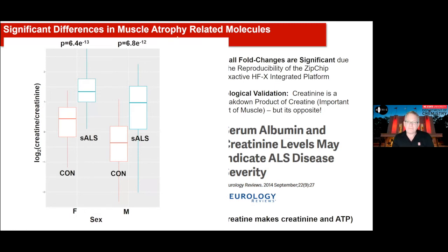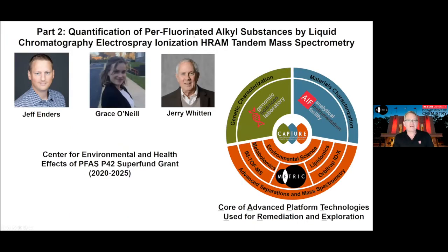So that's part one of the story in terms of BMAA. And again, with that internal standard, we were really able to develop a very specific and quantitative method to unravel whether or not we could detect this neurotoxin in ALS patients.